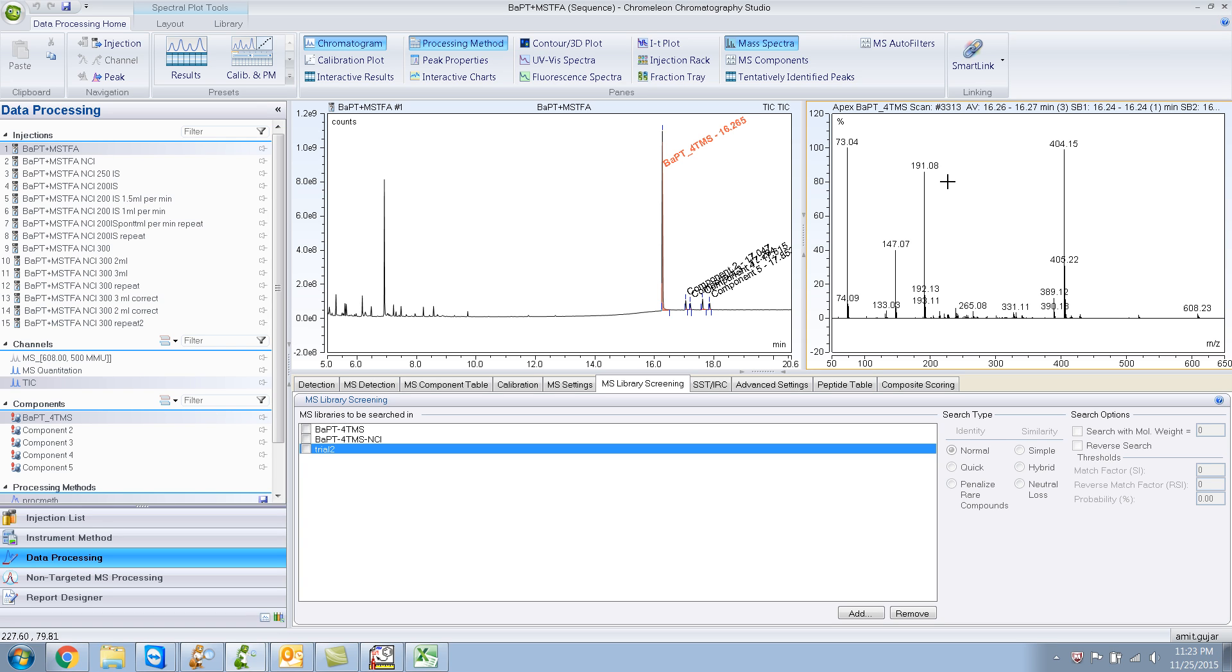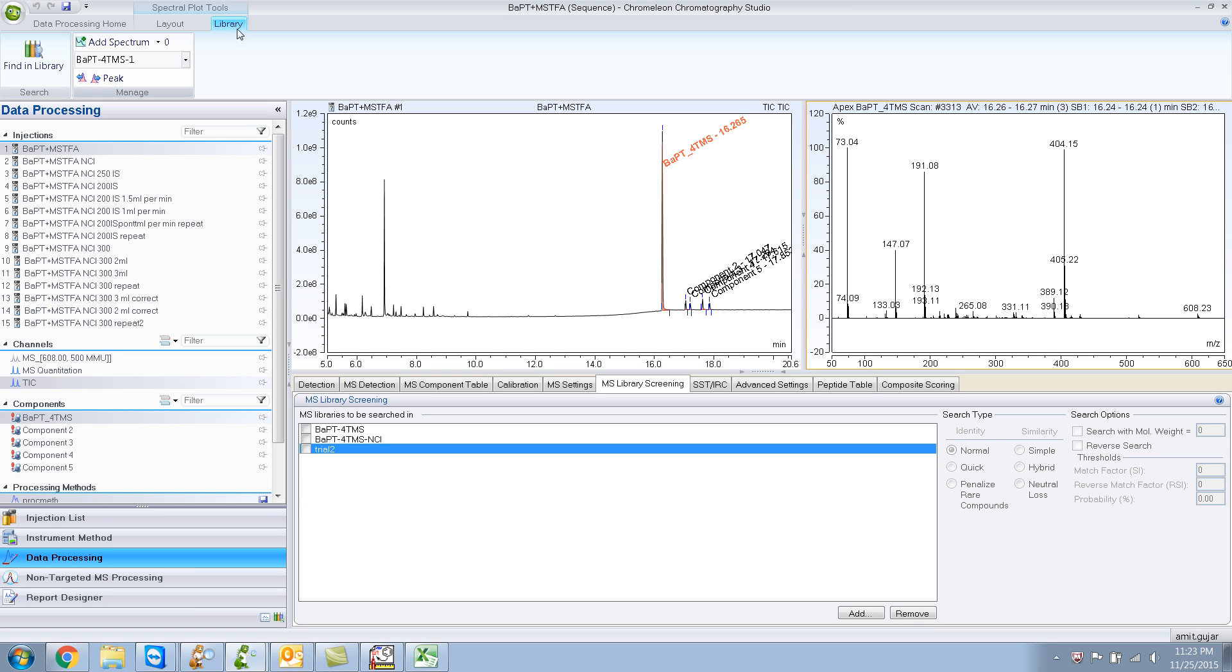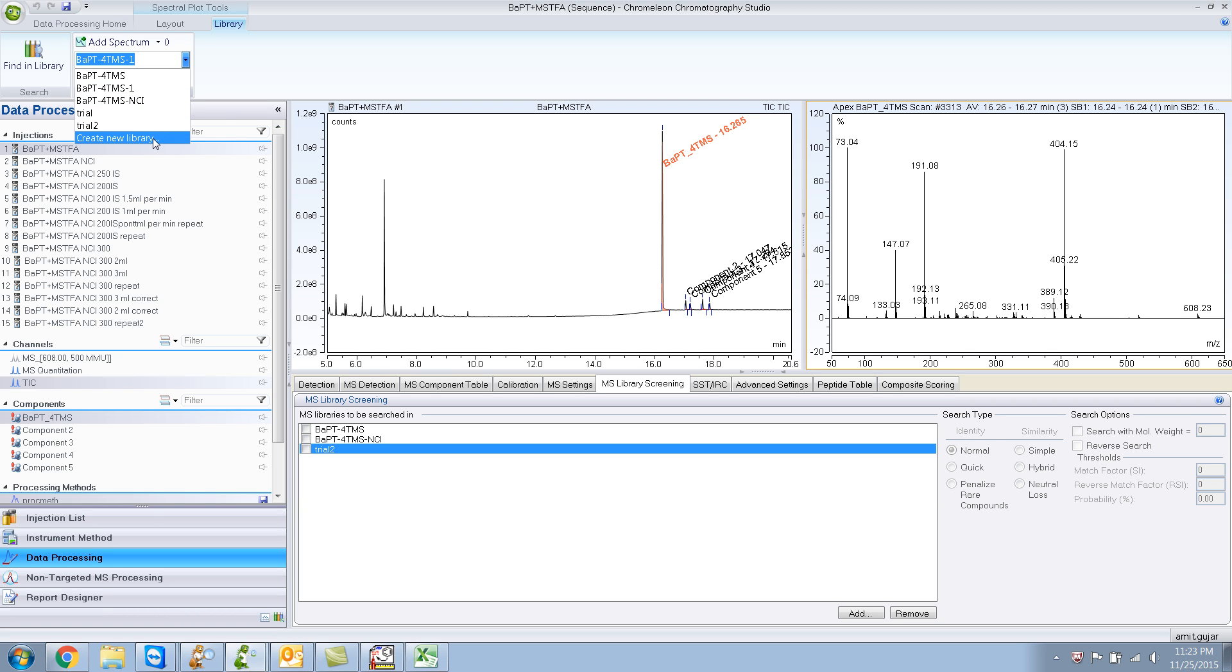The first way by using Chromelion only is, you make sure that you're in the mass spectral pane. Then you go to library. And then you go over here. And then you say create new library.